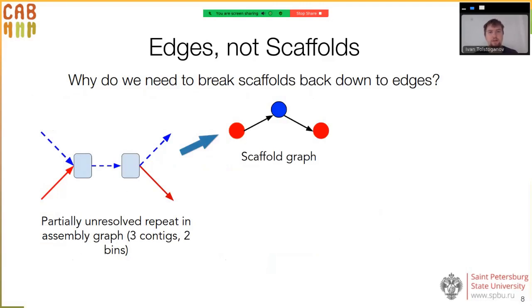Very roughly speaking, graph-based refining tools try to propagate labels from bin vertices to neighboring unlabeled vertices and change the label of a bin vertex if most of its neighbors have different labels. So if we use a scaffold graph representation of the assembly graph, we might try to correct the blue contig based on the graph information and reassign it to the red bin, which would be erroneous.